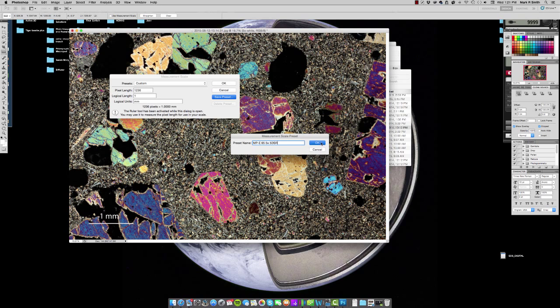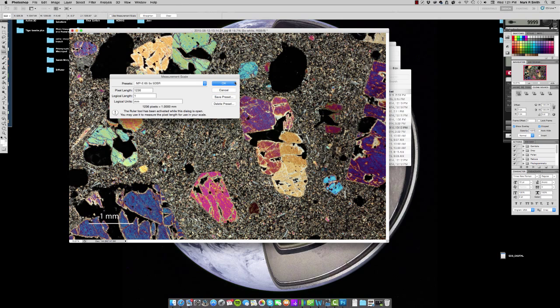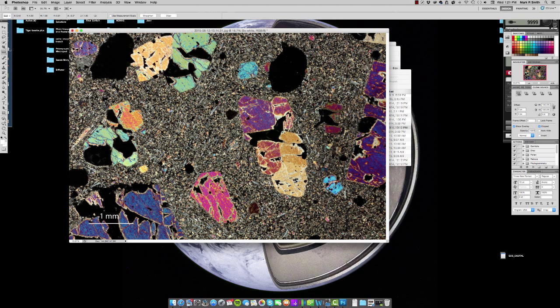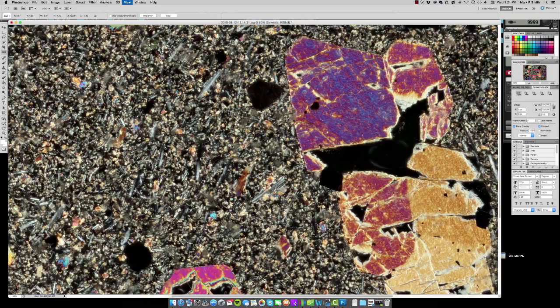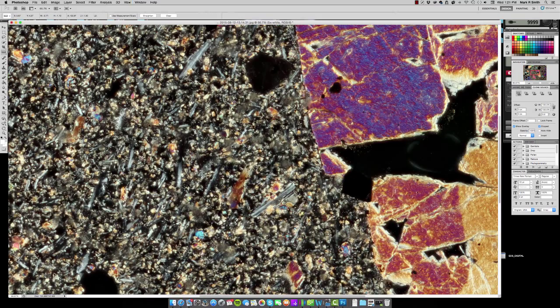So once that this is finally finished saving, what I can do is I can go back to that ruler tool, and I can select any area of the image, drag it, and I can go up top to the L1. And that's my distance in millimeters.